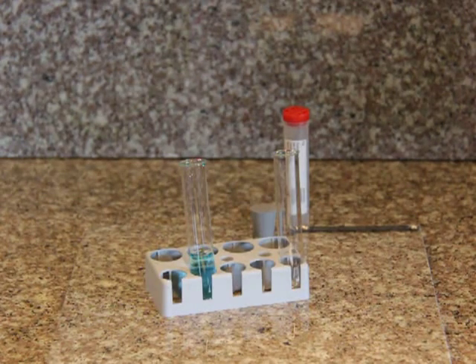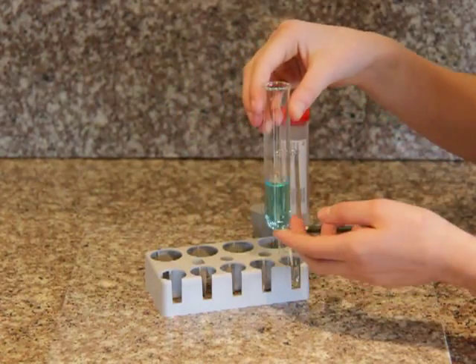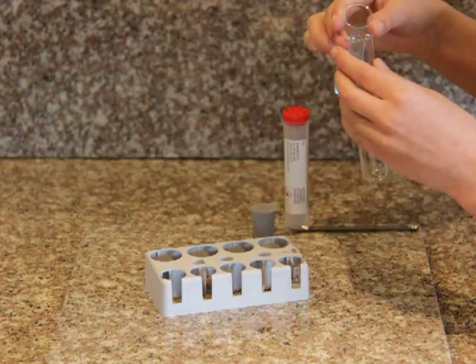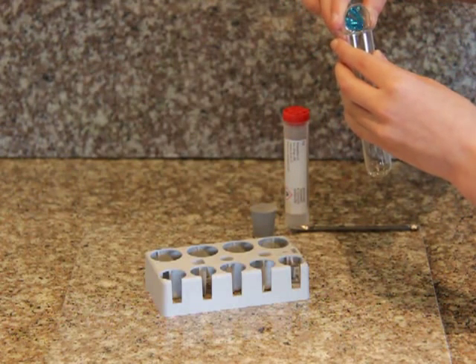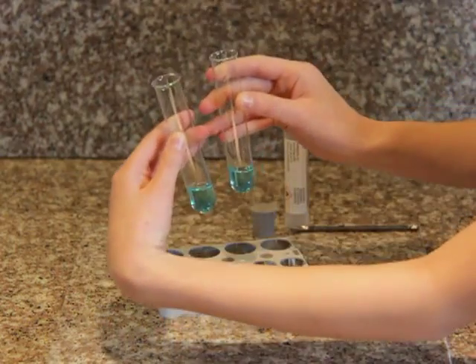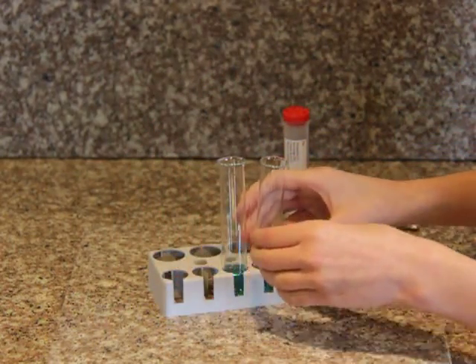To do experiment number 11, I need to pour half of the copper sulfate solution from experiment number 10 into a second test tube and set the other one aside.